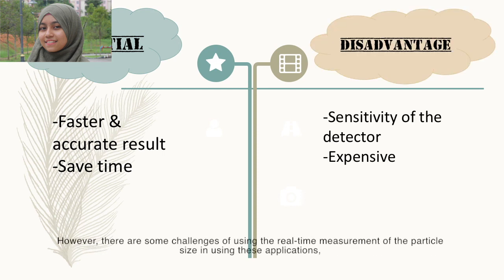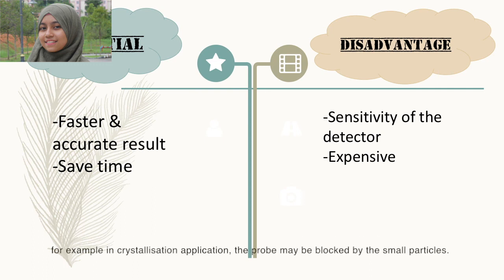However, there are some challenges of using the real-time measurement of the particle size in these applications, of which the most significant and the most obvious is that the probe of the instruments is very sensitive to certain conditions. For example, in the crystallization application, the probe may be blocked by the small particles.